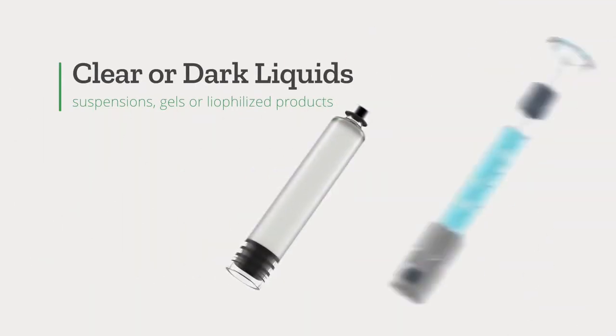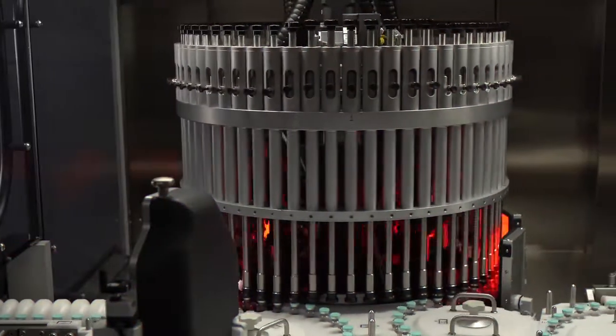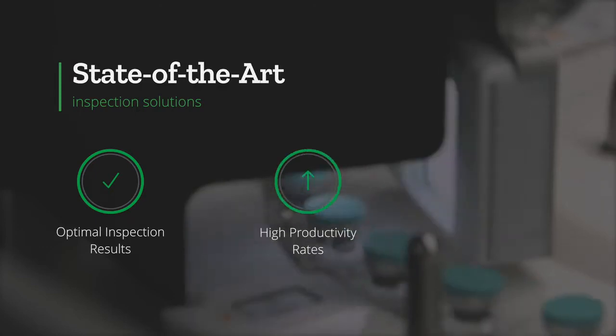heavy suspensions, gels, or lyophilized products. These state-of-the-art solutions provide optimal inspection results and high productivity rates while minimizing false reject rates.